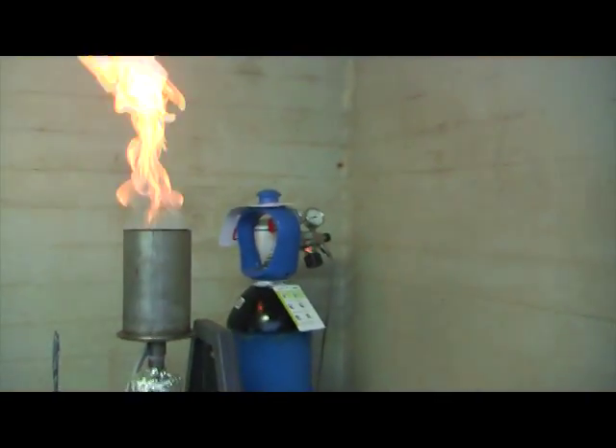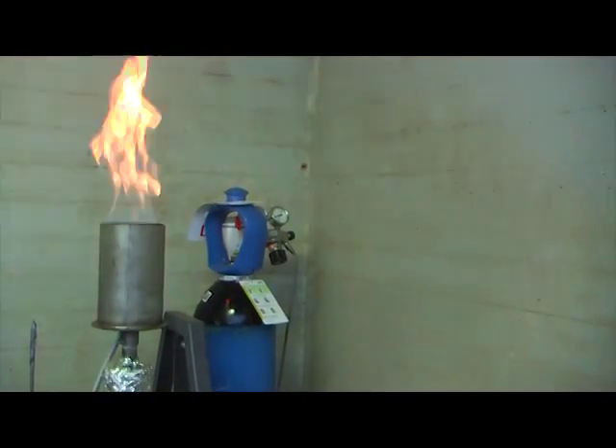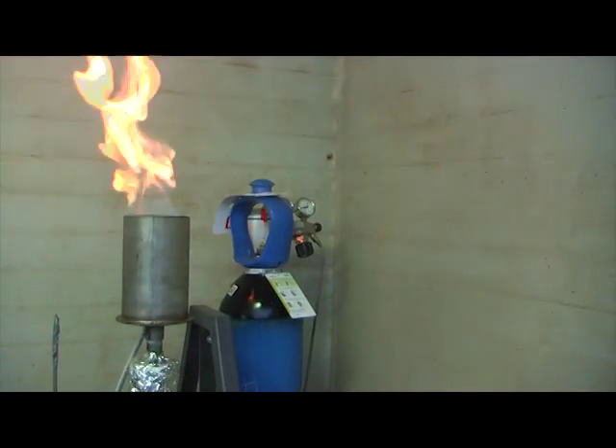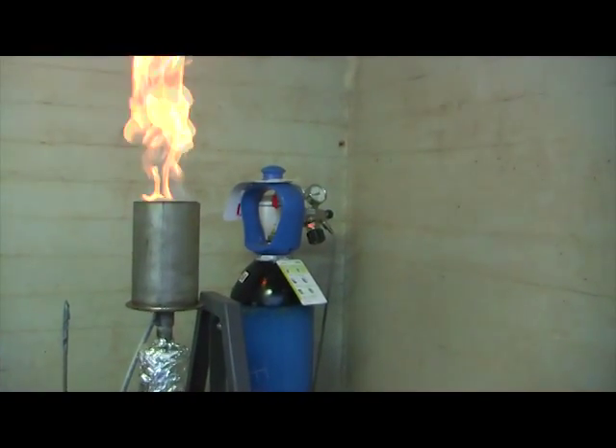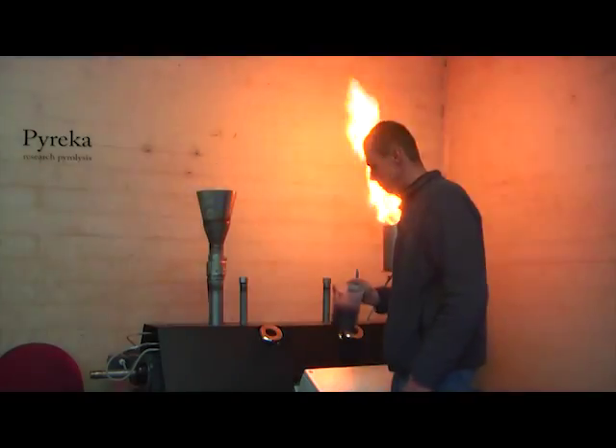There in the back you have nitrogen inert gas that we use for the gas flow and the reduction of tar. We can pyrolyze all sorts of biomass.